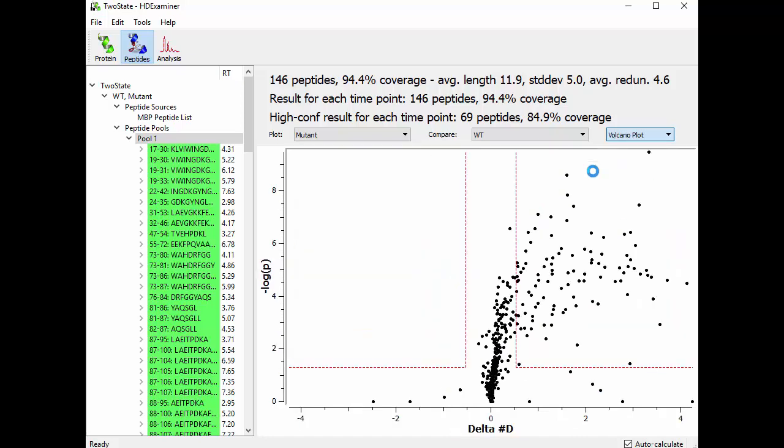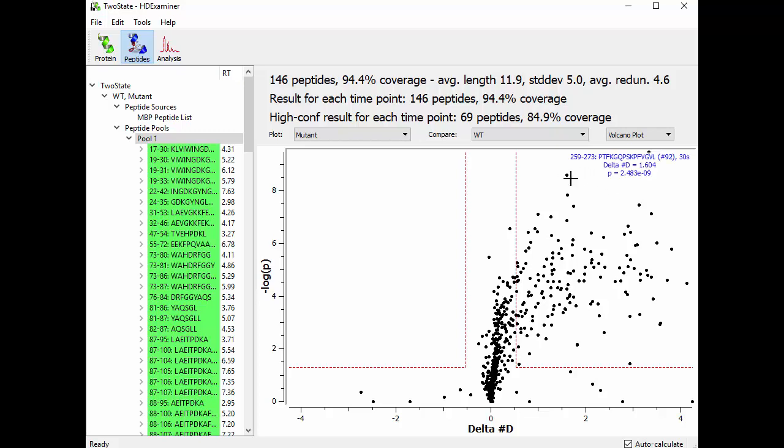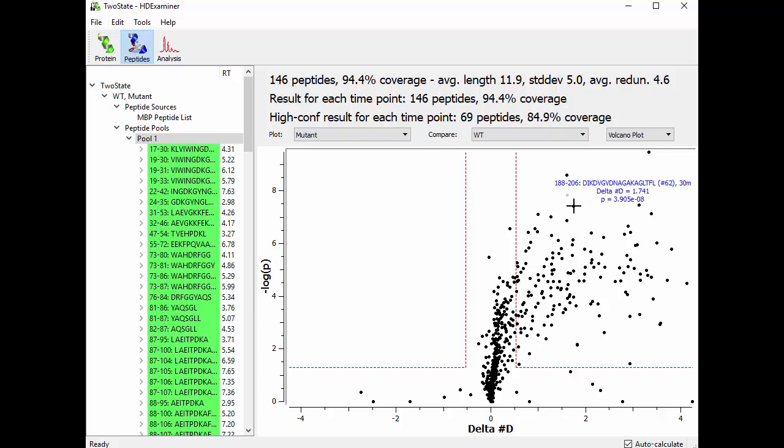So if you select that, you see a plot that looks like this. So what are we looking at here?